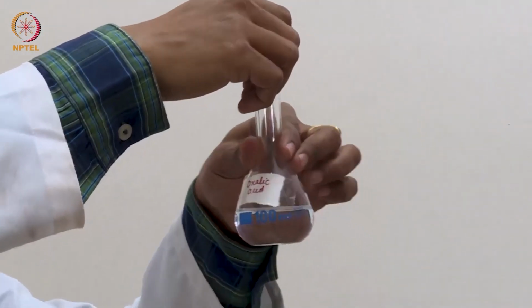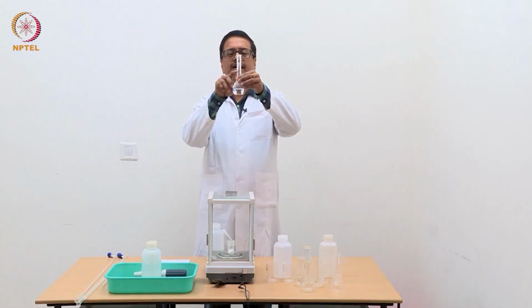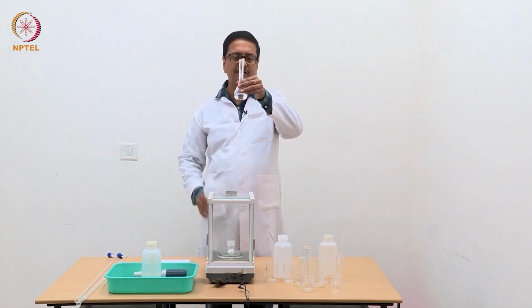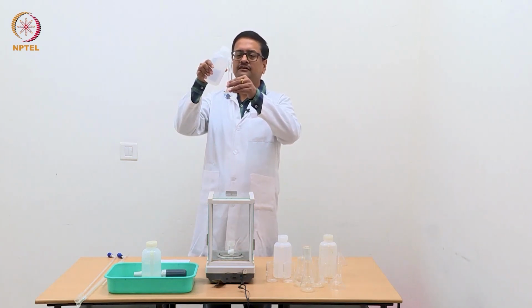So, now I am going to fill the volumetric flask and you can see there is a mark here, that mark at this line indicates the 100 ml of this volumetric flask. So, we should fill this volumetric flask with water up to that mark carefully and should not overshoot.